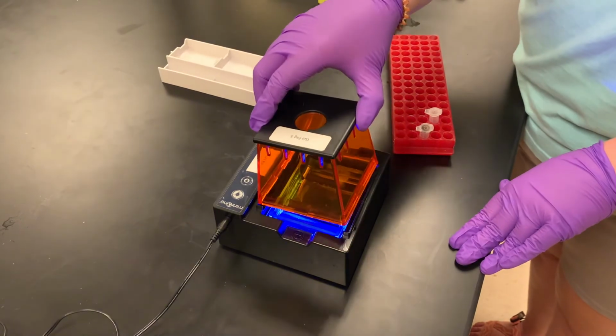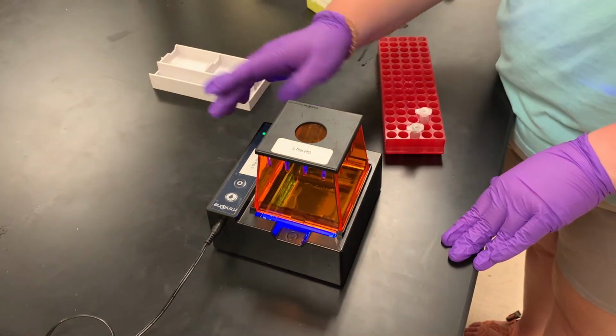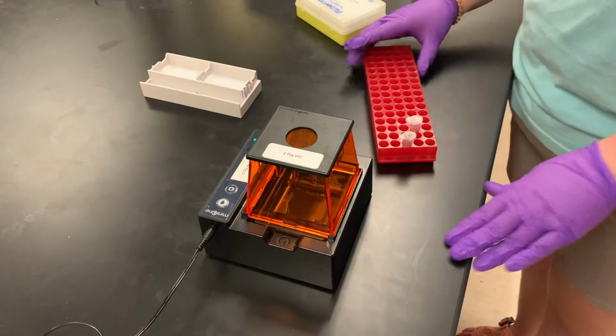Place the cap on the gel rig, turn off the blue light, and press the power button. Allow the gel to run for 20 minutes.